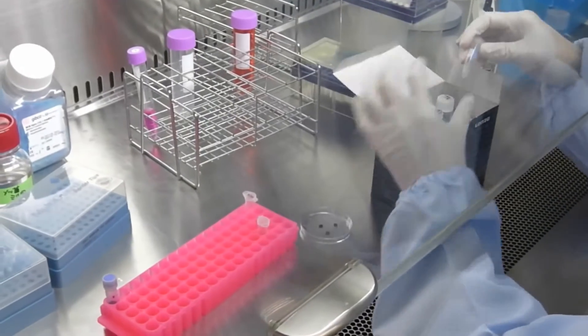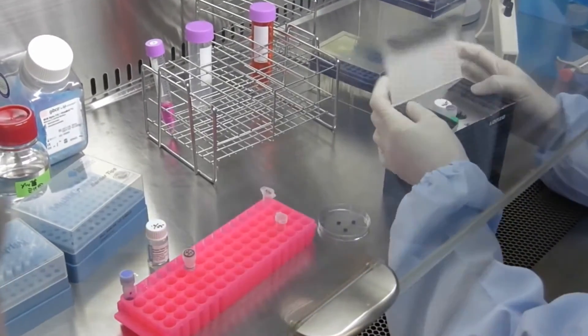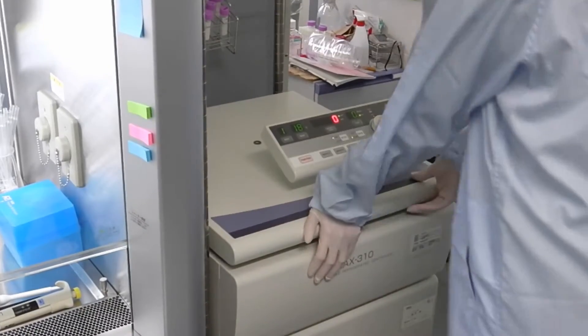During centrifugation, the episomal vector, gene transfer reagent, and gene transfer device are prepared.